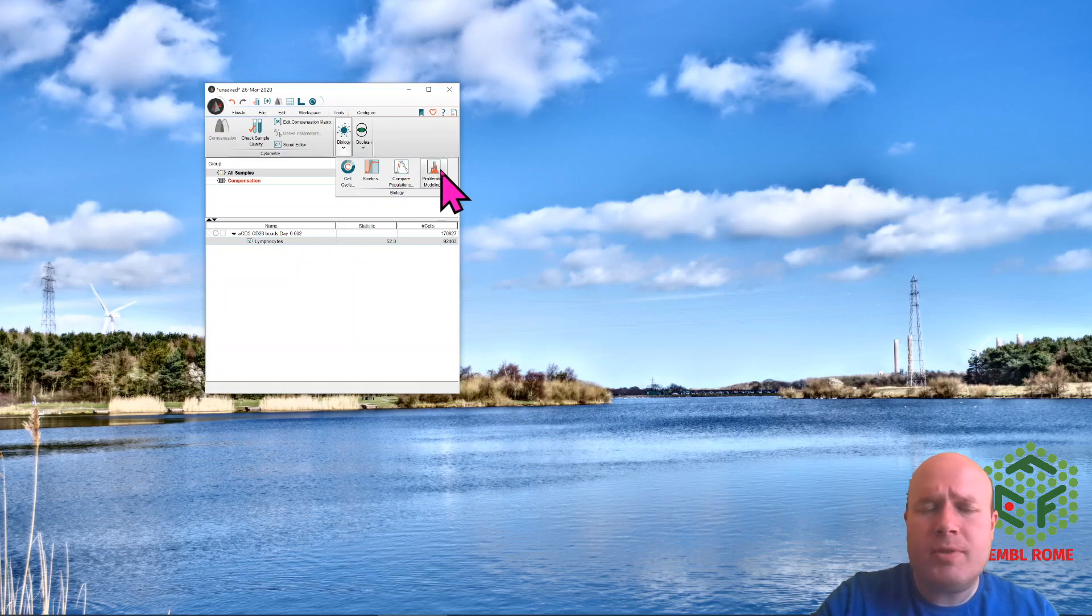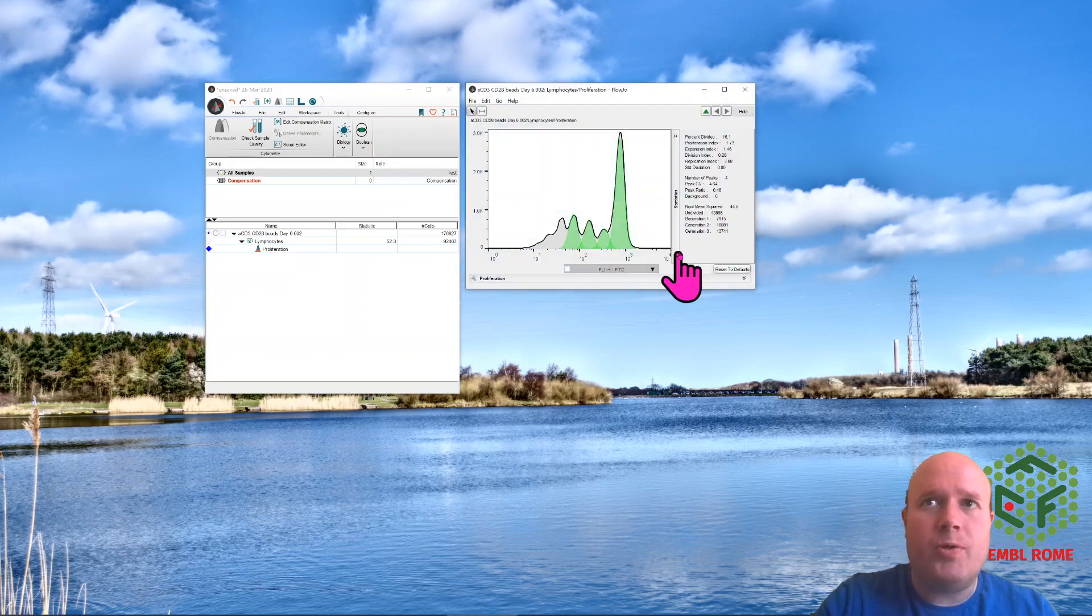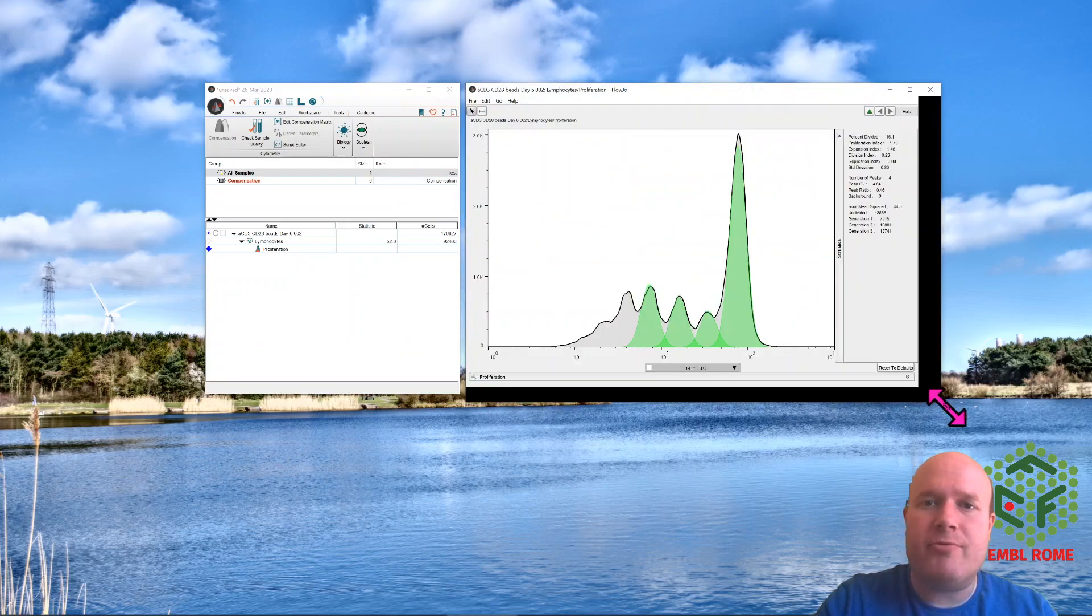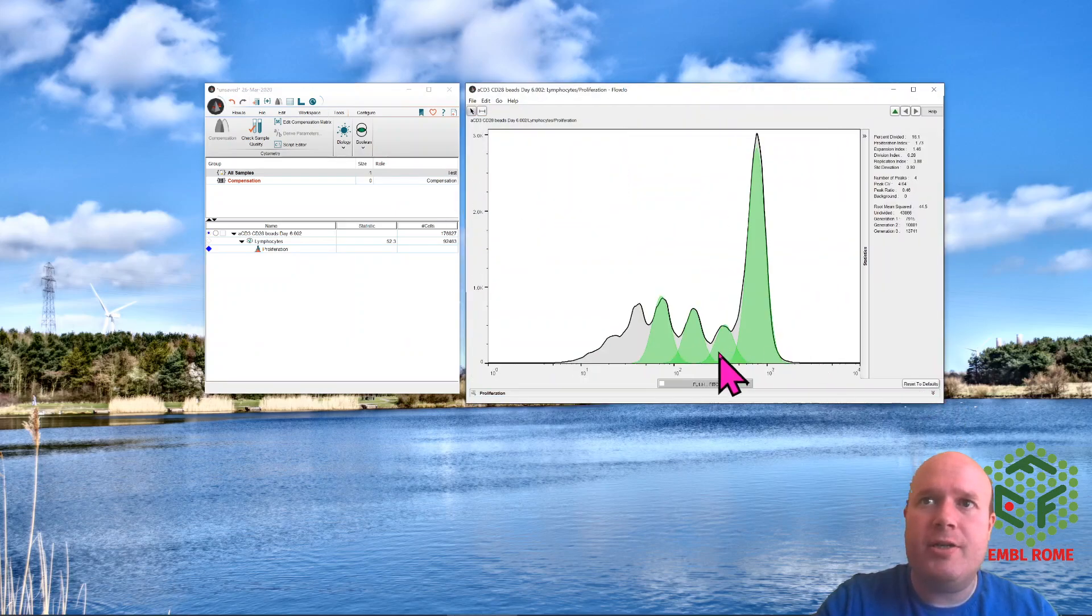And this will take a few seconds, but it will open up this nice window with this proliferation graph.